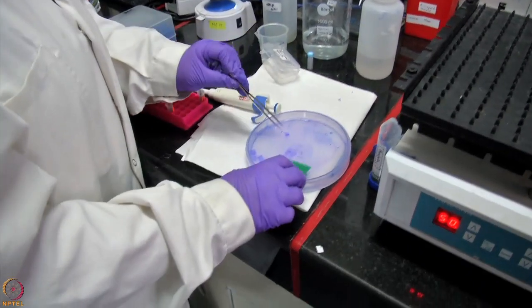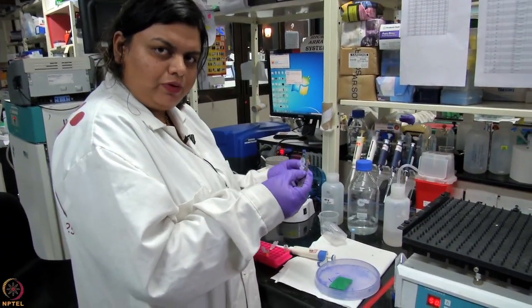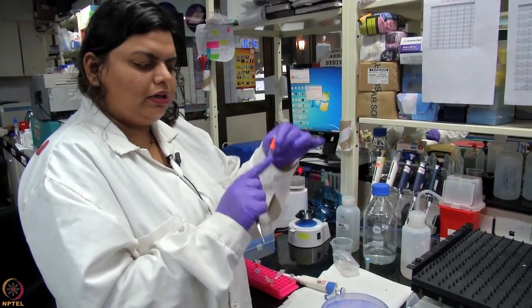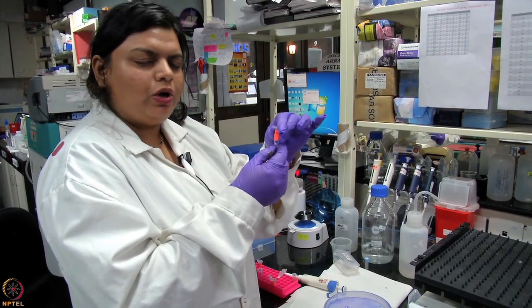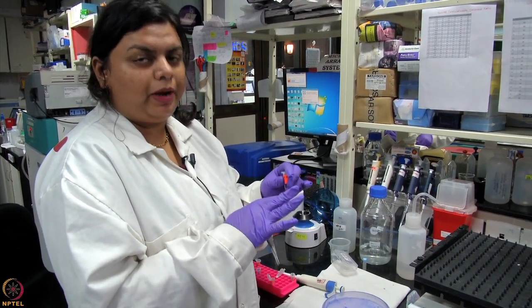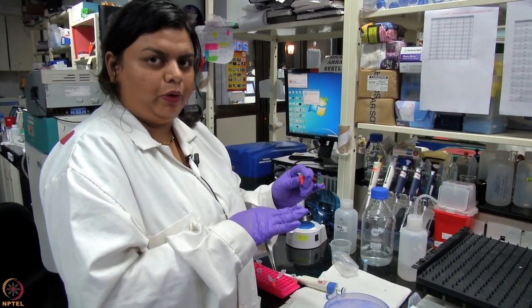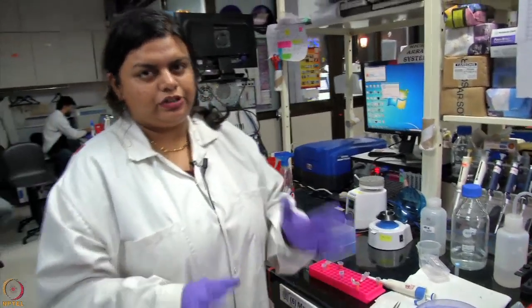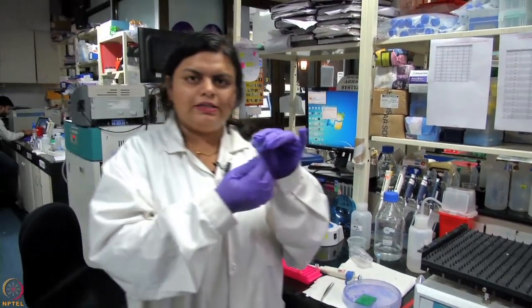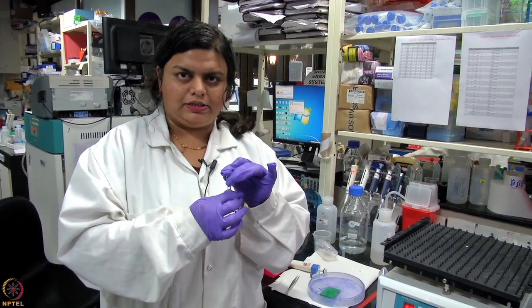So this we'll cut into further smaller fractions. We'll take the band that has been excised from the gel and we'll perform an in-gel digestion. Here, you can see this small band may have hundreds of proteins which are potentially the interacting partners of the protein of interest against which you had used the antibody. After this, in-gel digestion would be done and you will elute the peptides out. This is the digested peptide, and now we will inject it for mass spectrometric analysis.